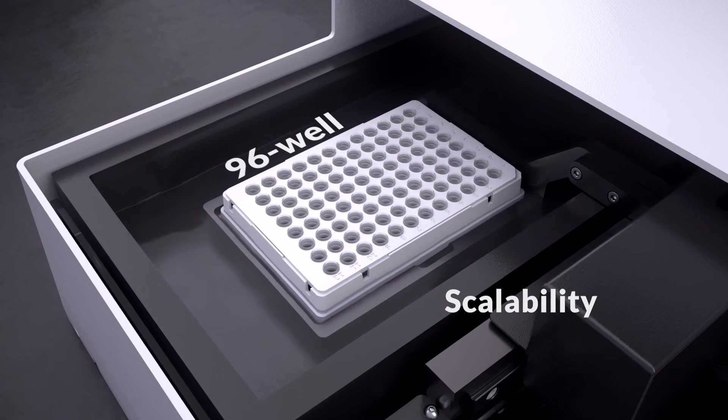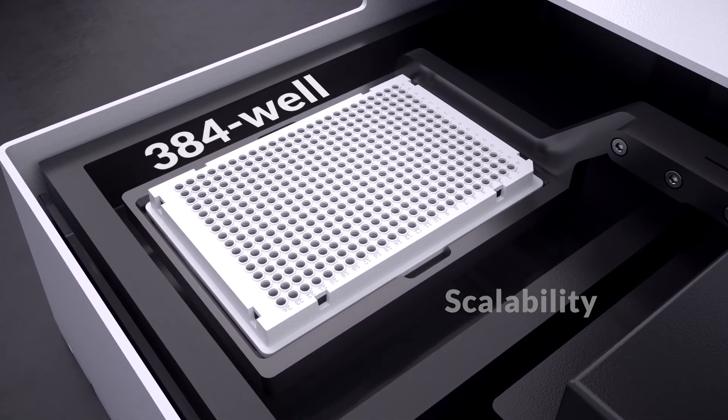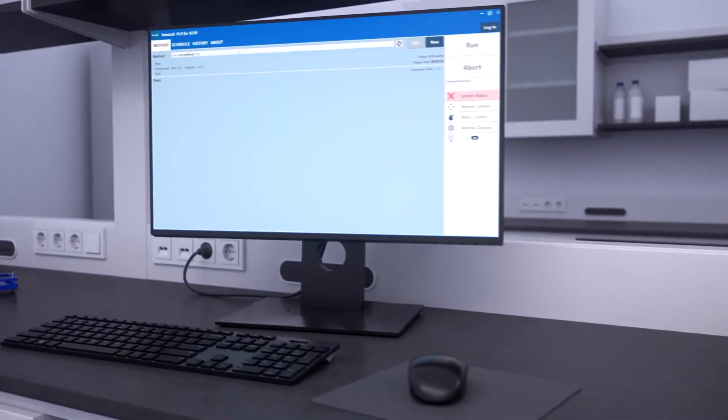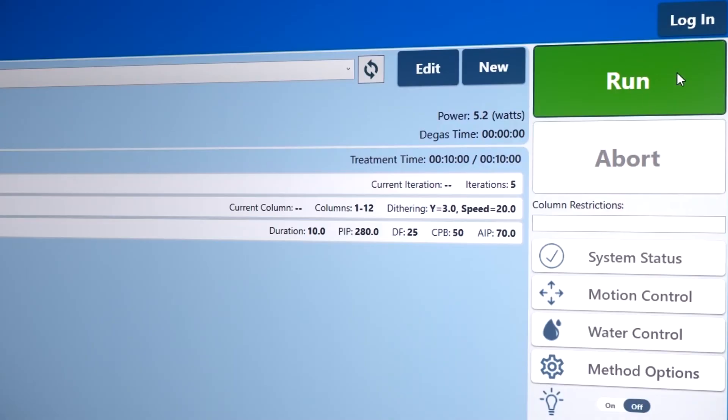The system offers scalability from 96 to 384 well plates to support high-throughput workflows. The Sonolab 10 software features an easy-to-use method editor that allows you to hit, run, and go.